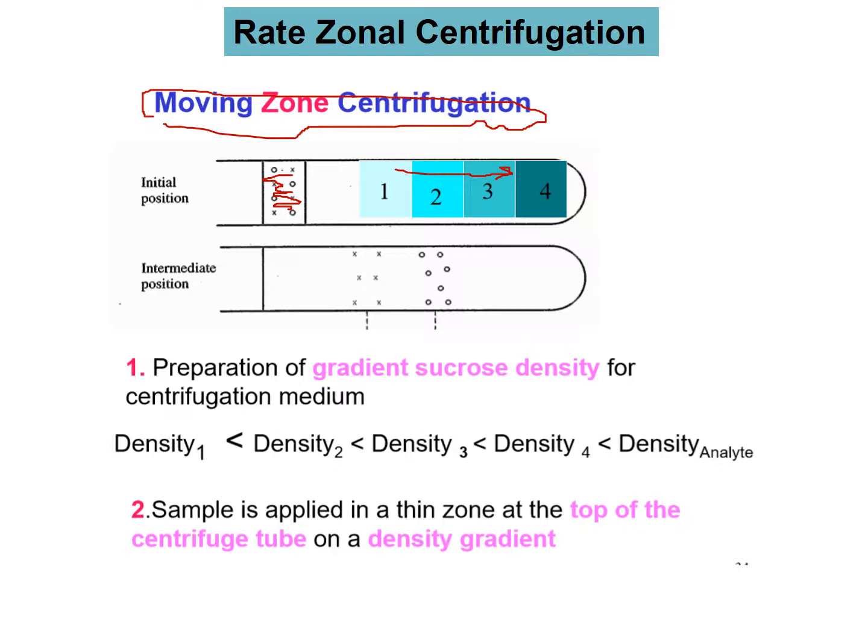And so initially, and then with enough time and spin in the centrifuge, you will get some separation of fractions here. It looks like one ends up in fraction or area 1, and this material ends up in fraction or area 2. Okay, and it shows the lightest, I guess it's going this way.